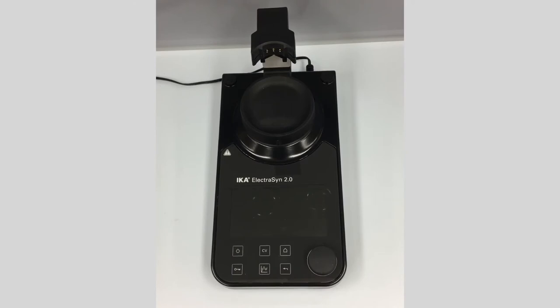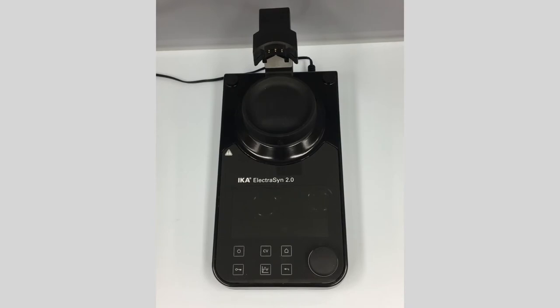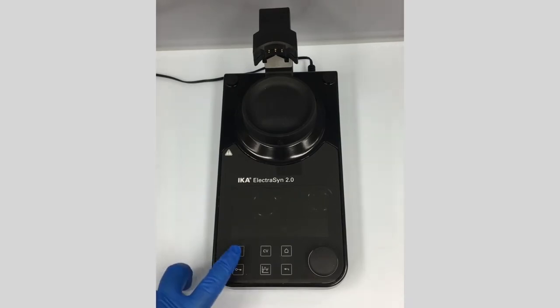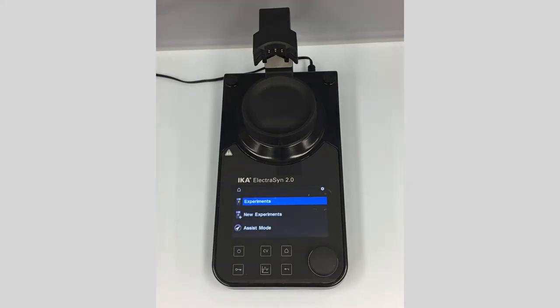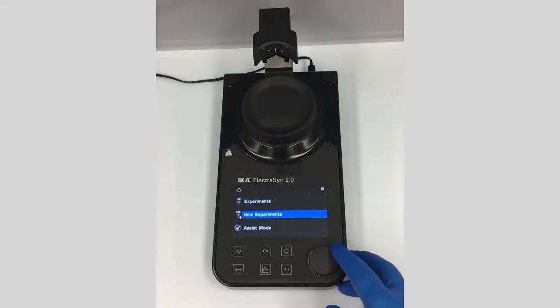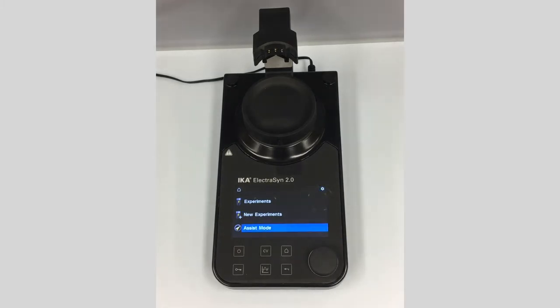Hello, and welcome to the IKA ElectraSyn Video User Manual Series. Here I would like to walk you through how to use the assist mode on ElectraSyn. So let's turn this on. Assist mode is really for new users who've never run an electrochemical experiment before and don't really have electrochemical conditions or aren't sure where to start.